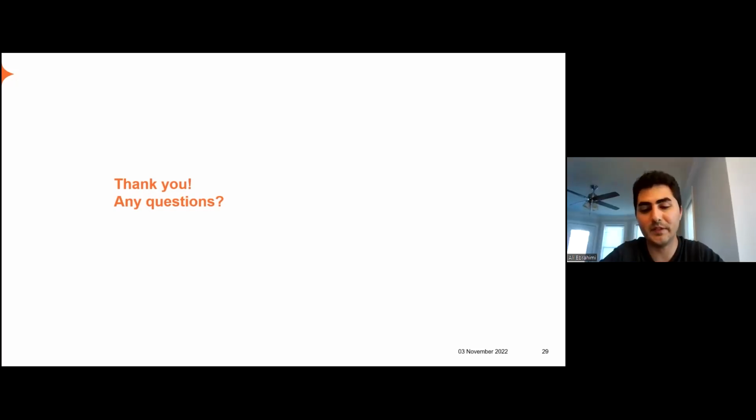Yeah, I think that's going to be a challenge. Ideally we want to use ex vivo models for human samples, and that might be easier to translate. But I think that's the same challenge that we have with bulk RNA-seq. There's the question of how much you can translate. But I would say that translation problem will still be an issue with spatial transcriptomics. It wouldn't go away.